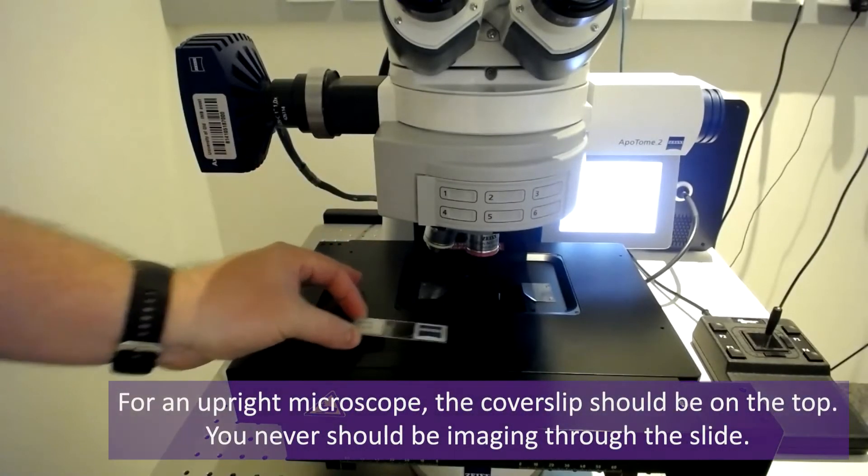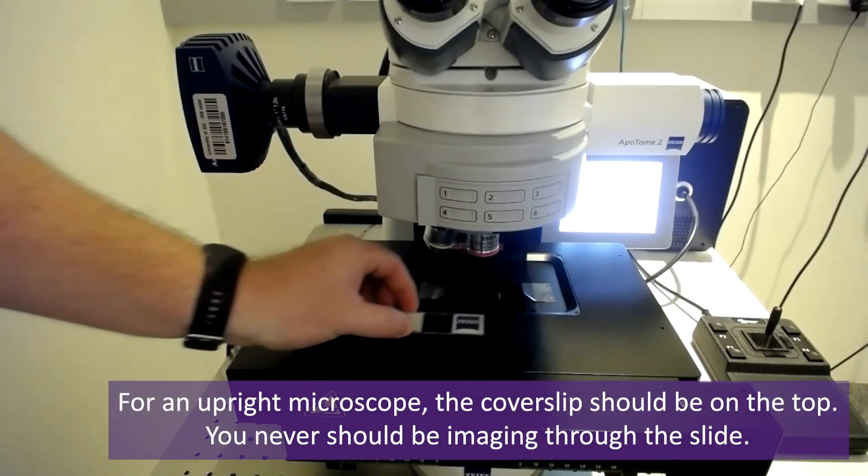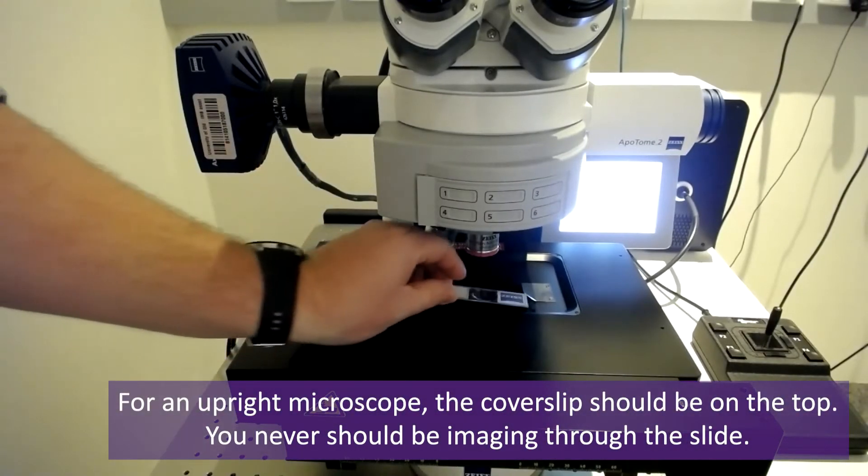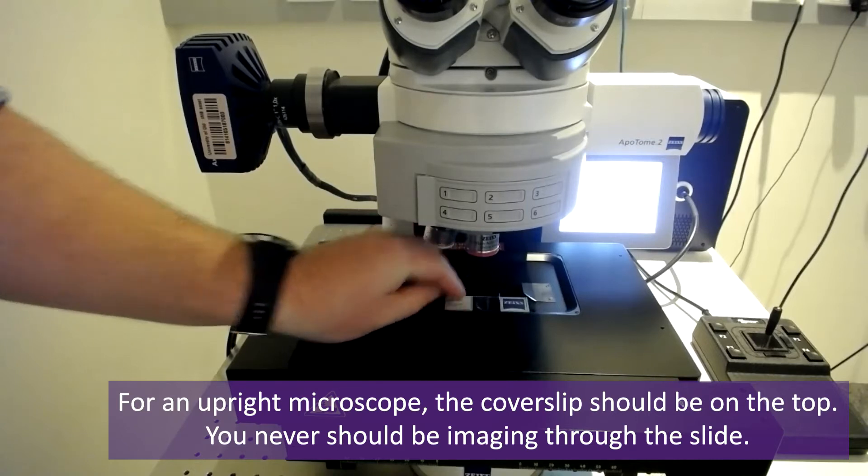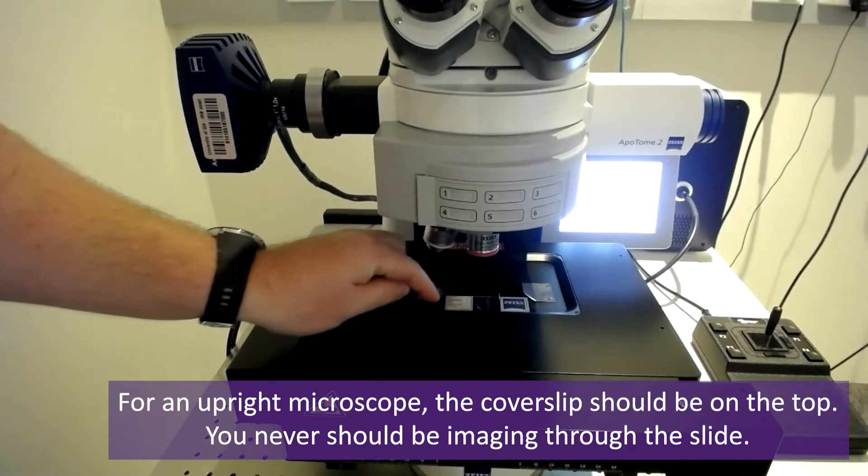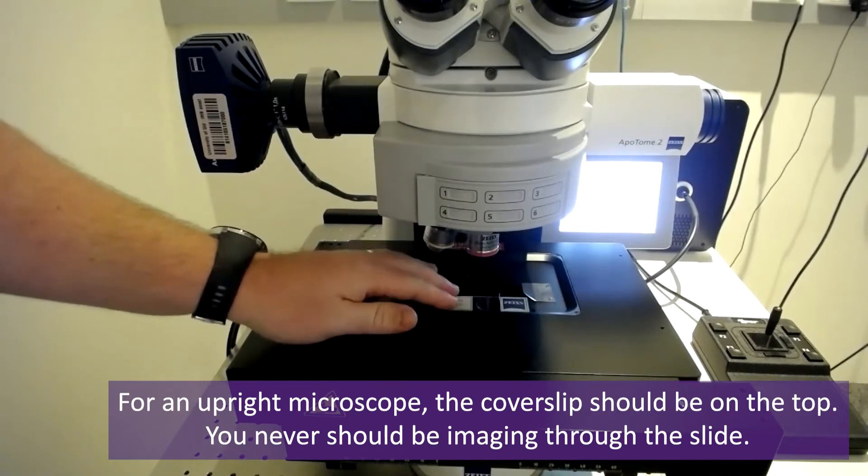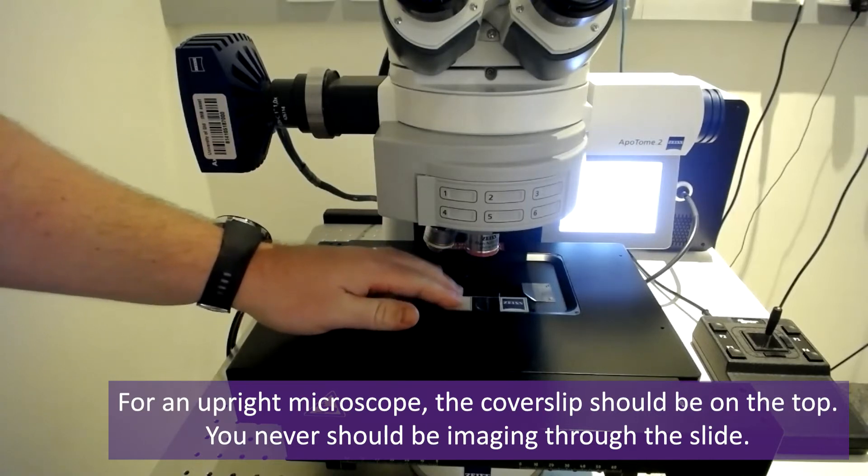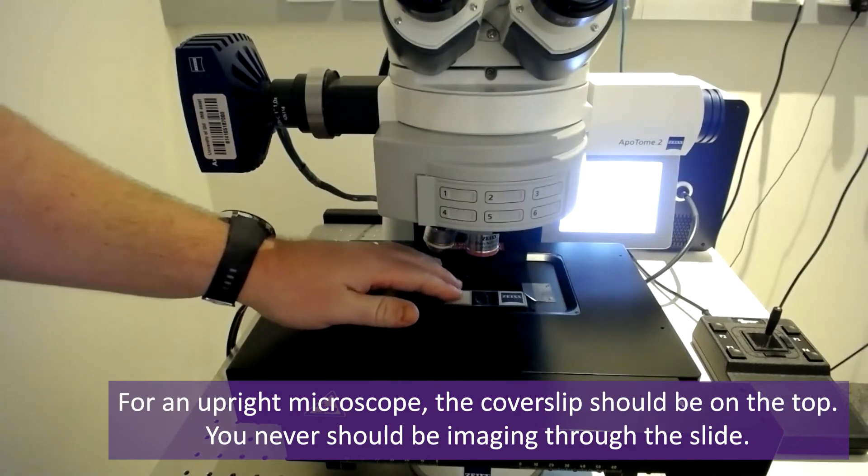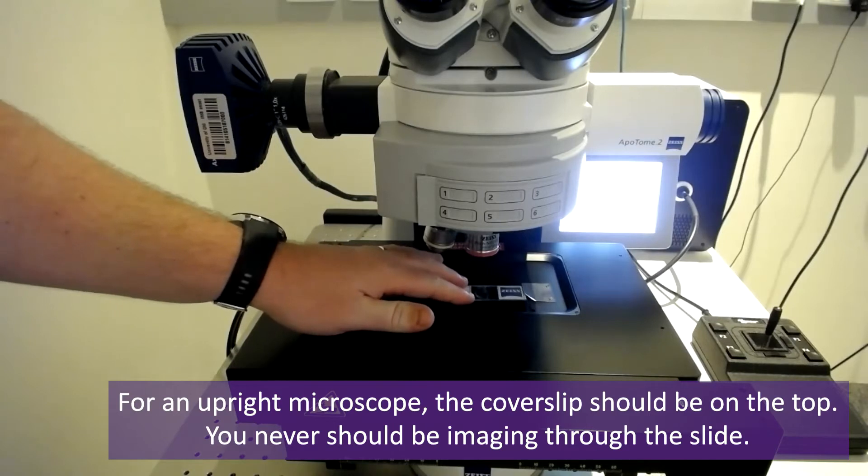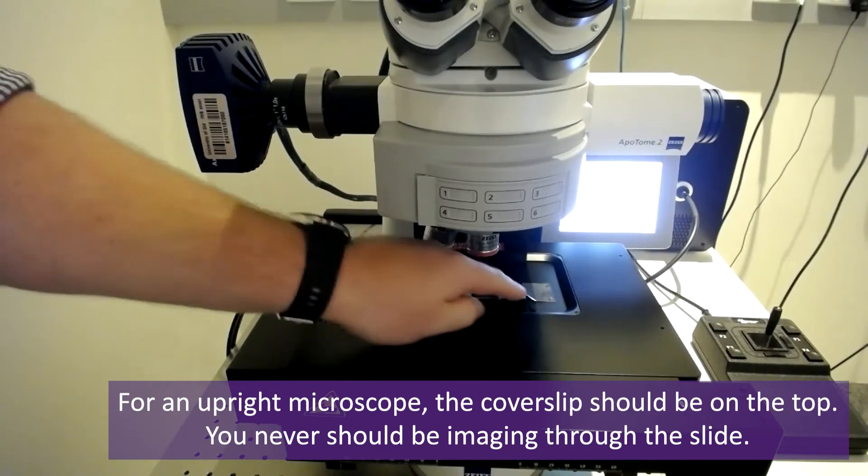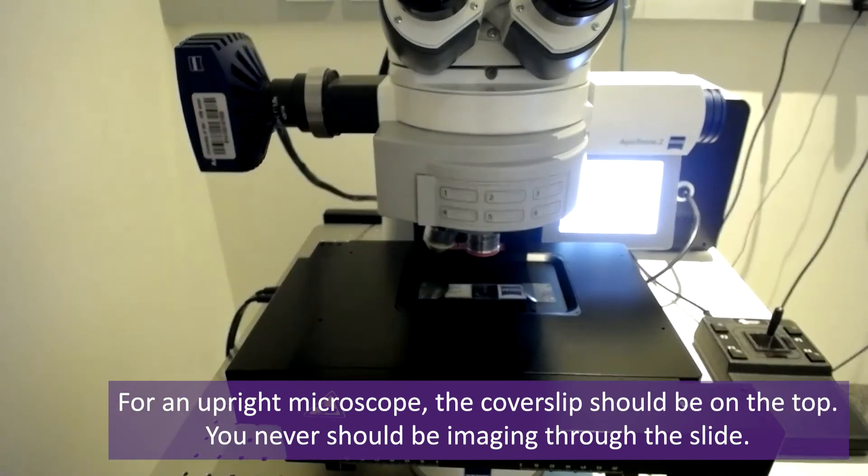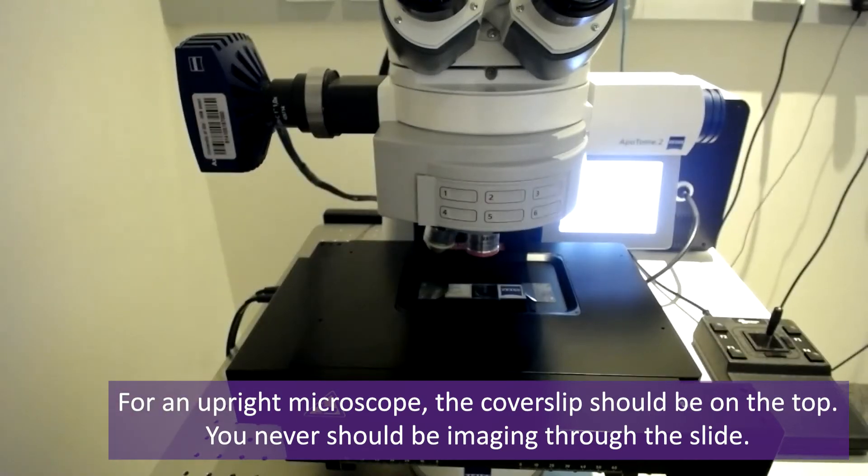To place your sample on the stage of this microscope, place the slide on the two small shelves and push it back under the metal tabs to hold it firmly in position. This is an upright microscope, so the cover slip should be on the upside.